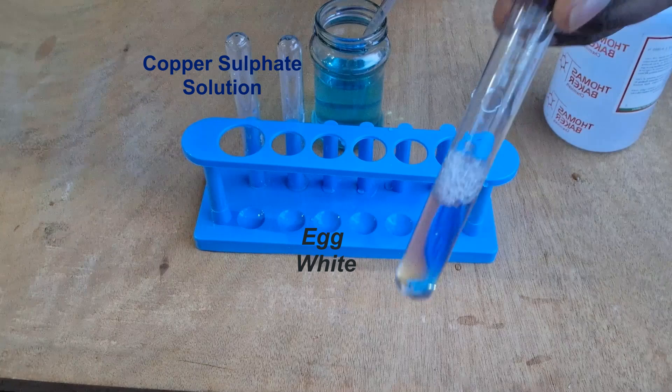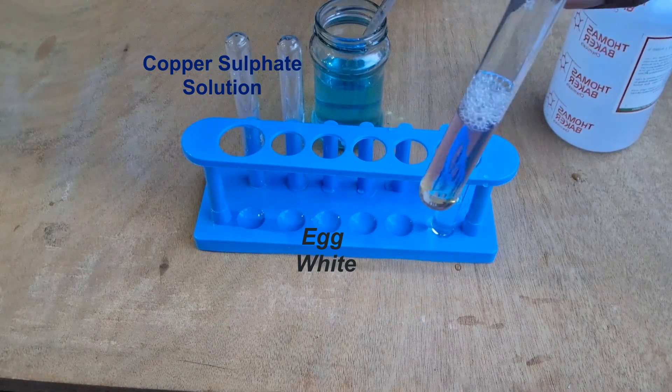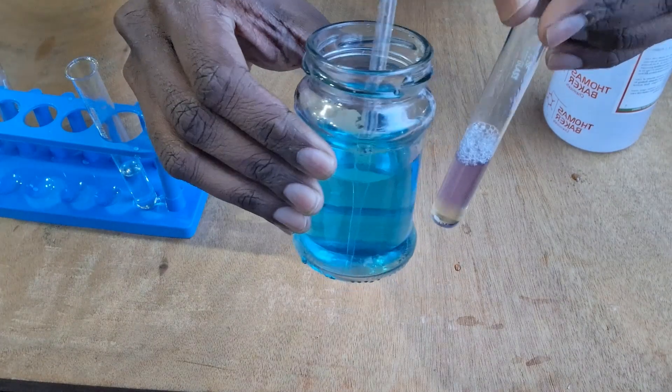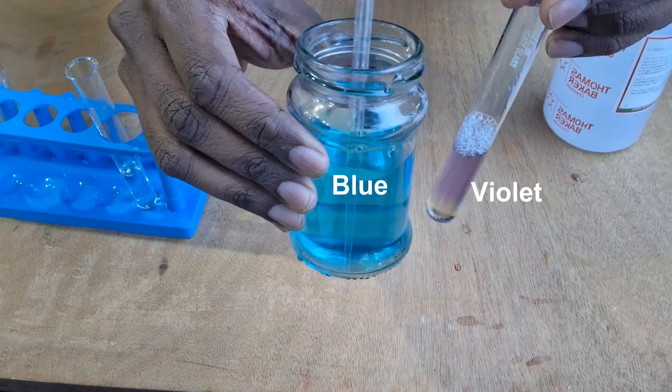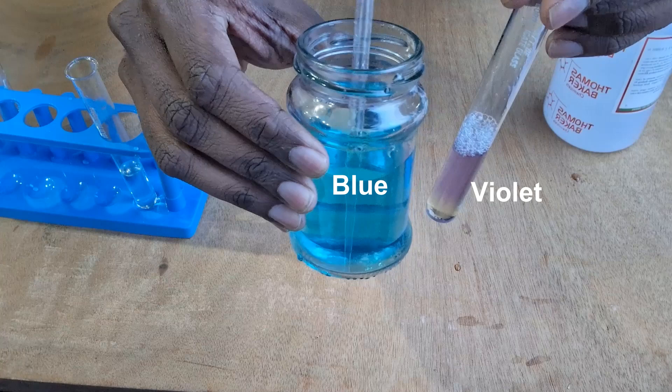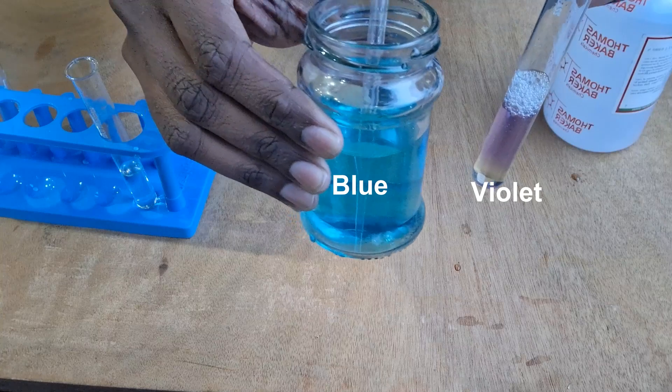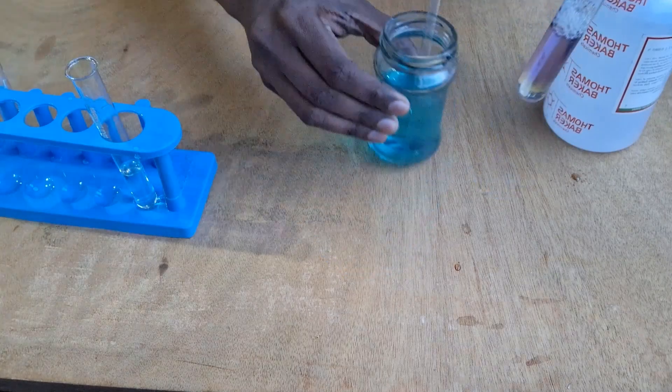Don't you think the color of the liquid in the test tube has changed? Interesting, isn't it? Copper sulfate was blue, but this test tube now looks violet. This change in color to violet happens only in the presence of proteins.